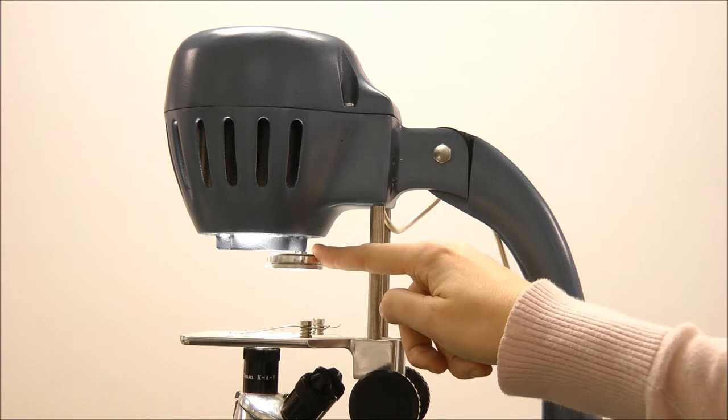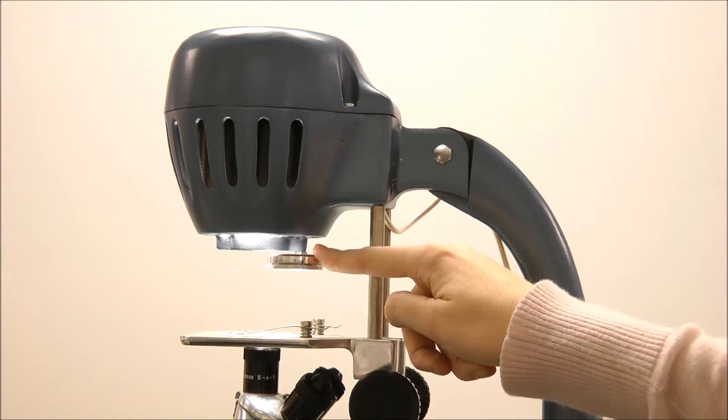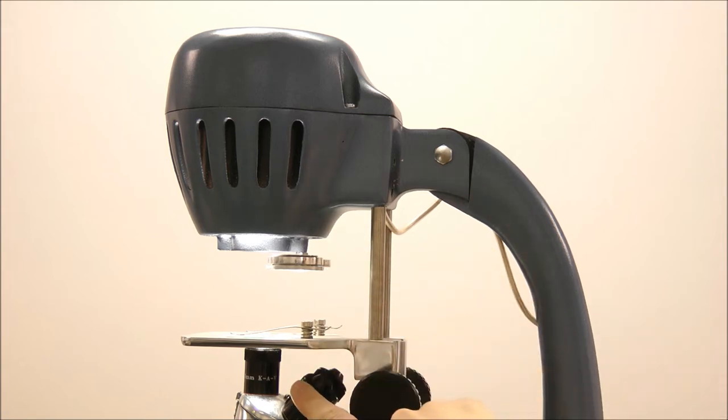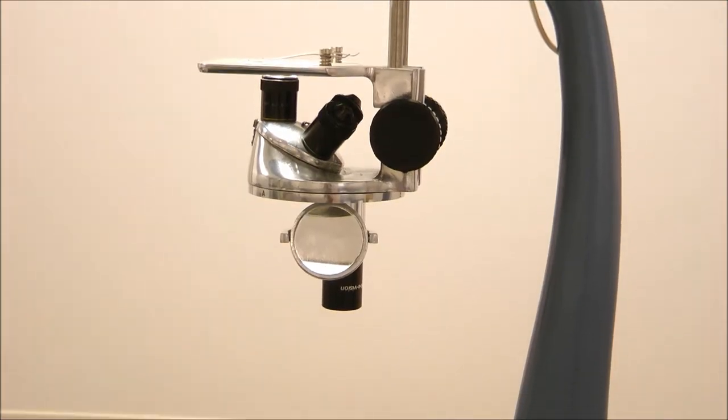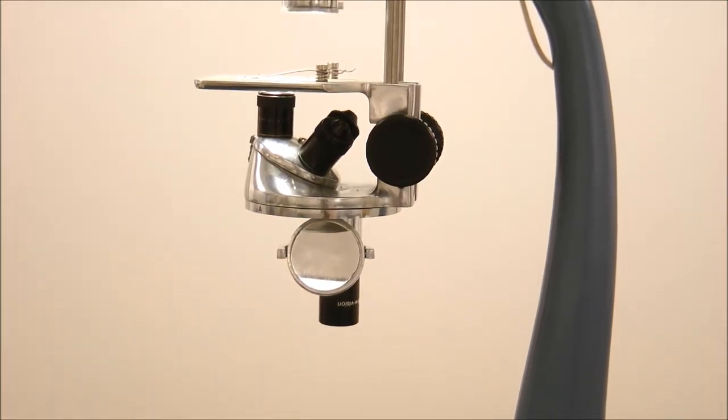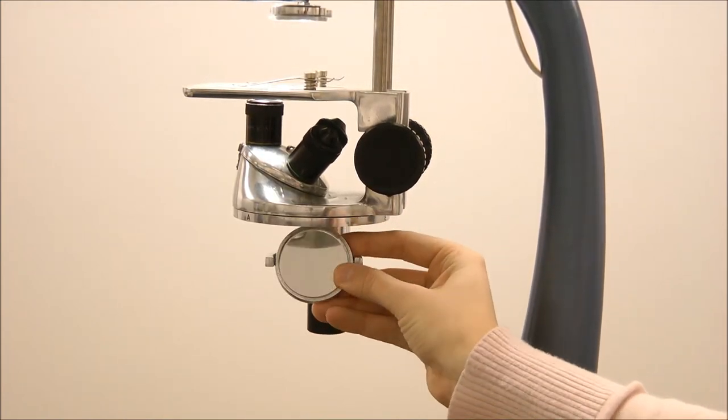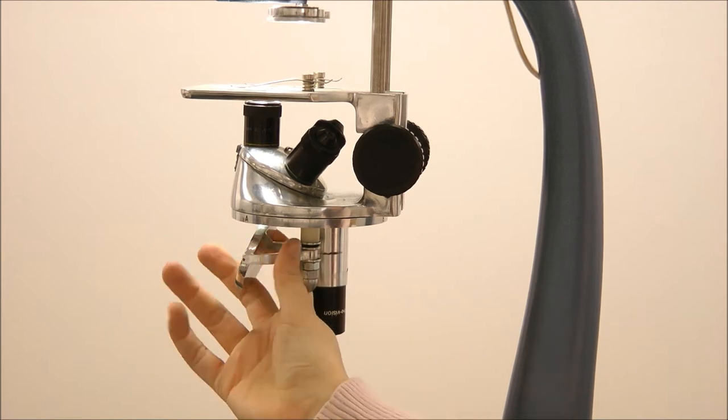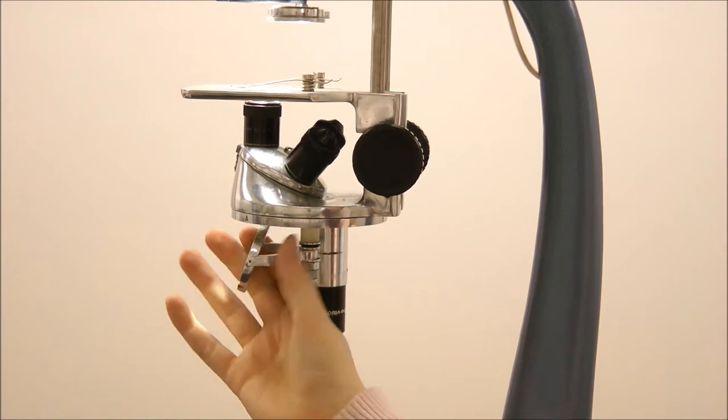You also have a revolving polarizer analyzer. You have the objective lenses. You have focusing knobs. And then finally a mirror that you can use or decide to not use by moving it out of the light source's path.